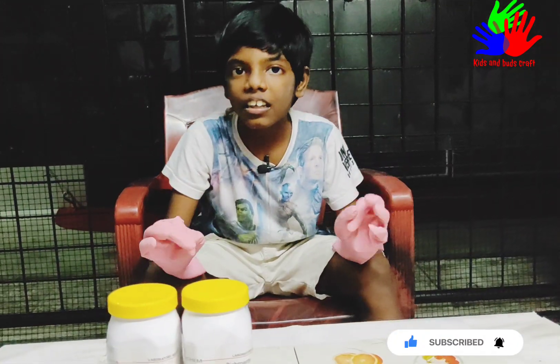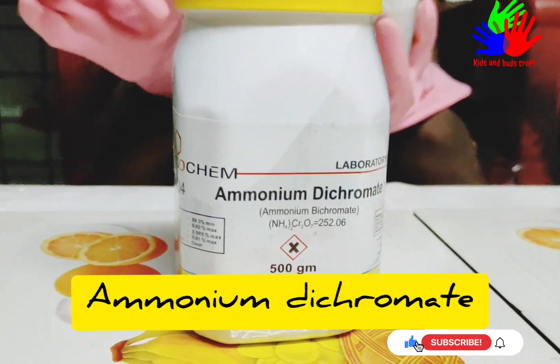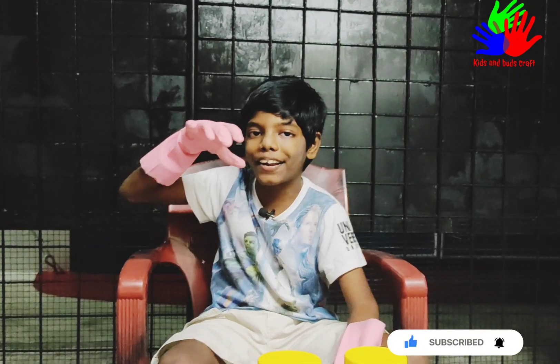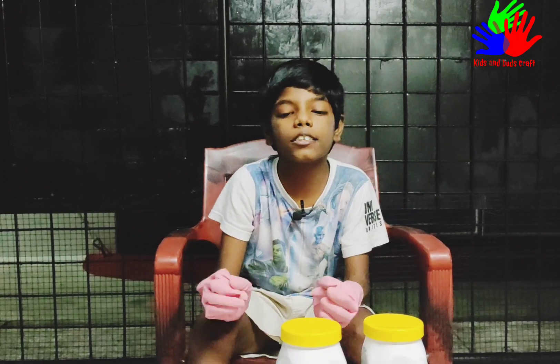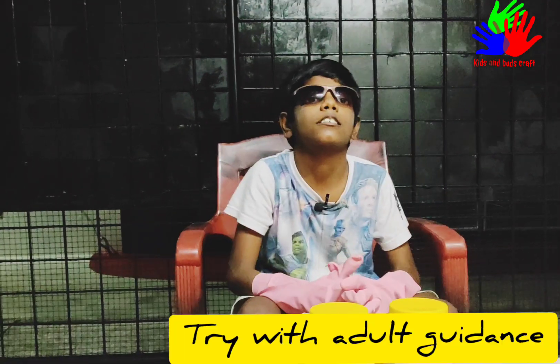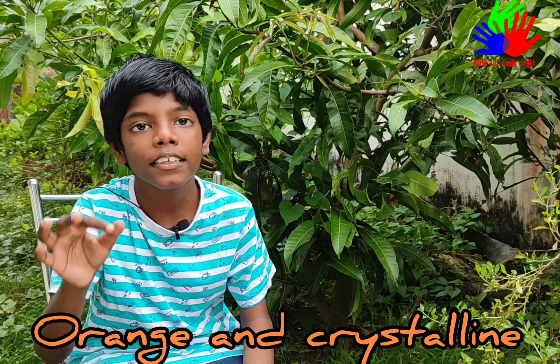For this science experiment we are using only two things: one is ammonium dichromate and sparklers. Friends, don't try this at home without your parents' guidance. I am trying this with my parents' guidance only. I am wearing gloves and glasses, so safety is first. Ammonium dichromate is orange and crystalline in nature.